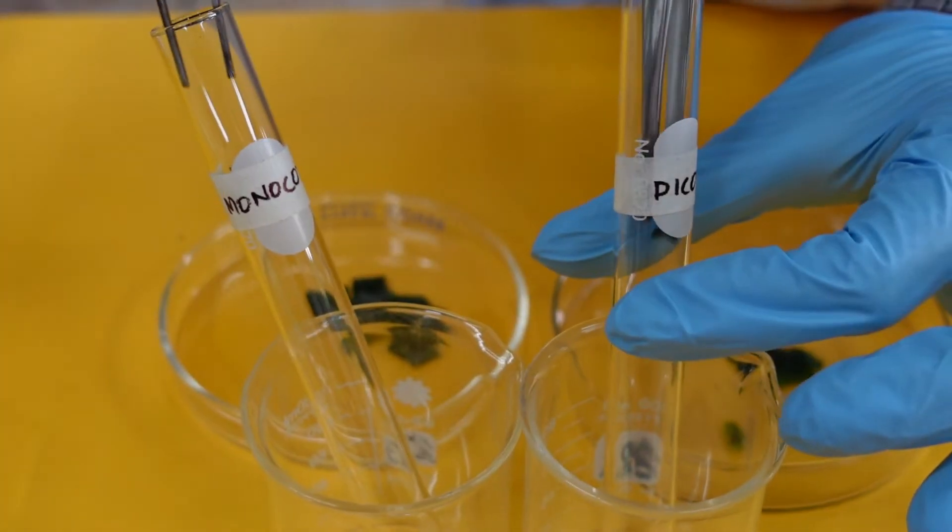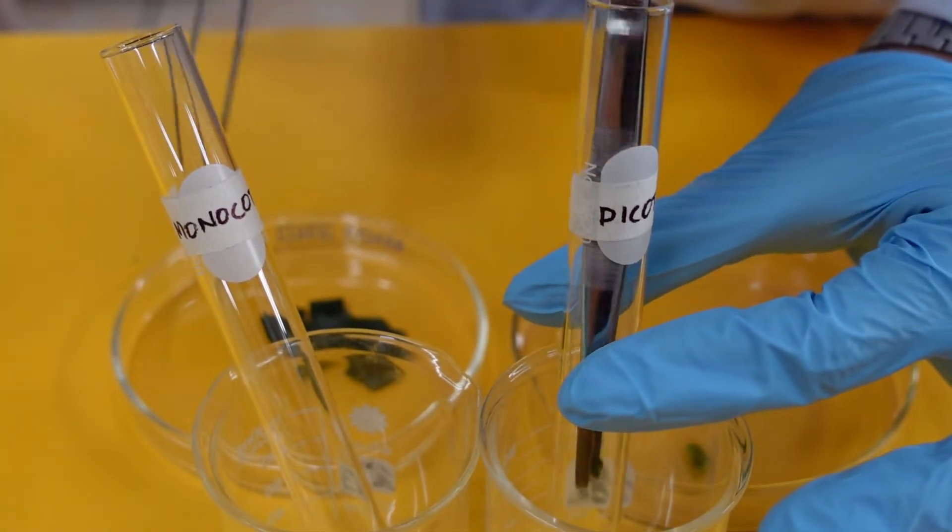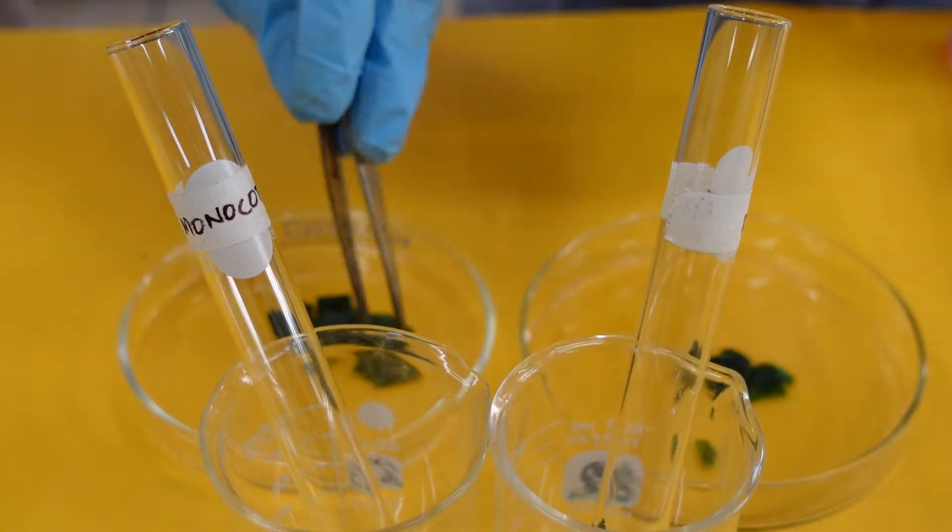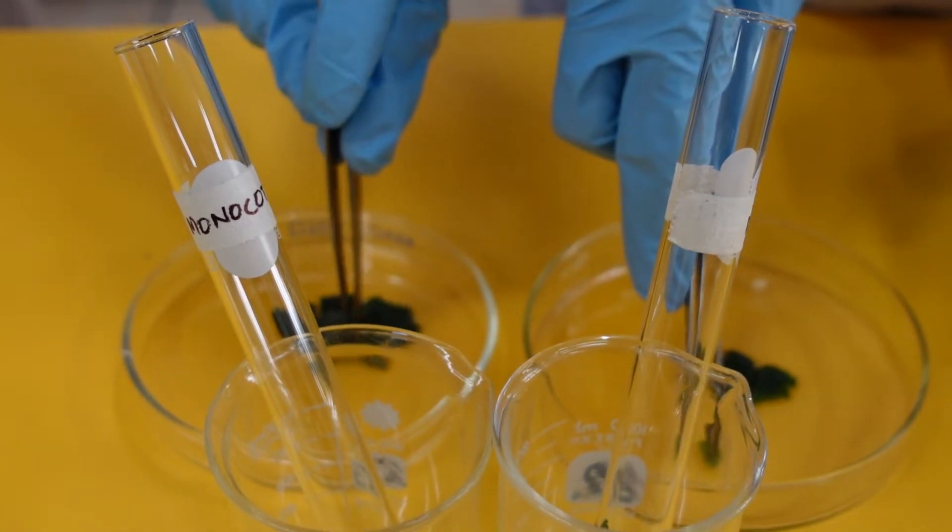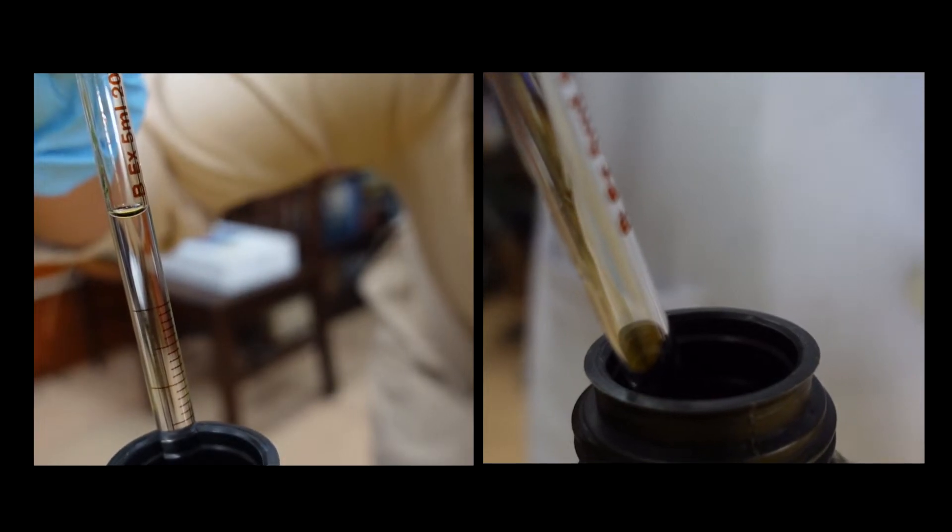Take the boiled leaves we have previously set aside. Place 2 to 3 pieces of these leaves in separate test tubes with 5 ml 95% ethanol.